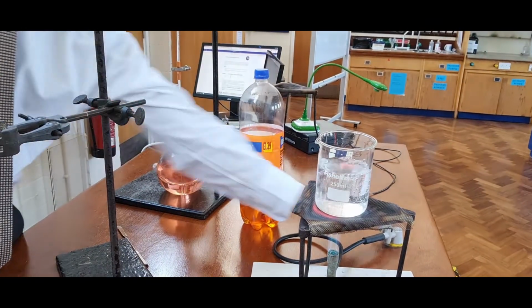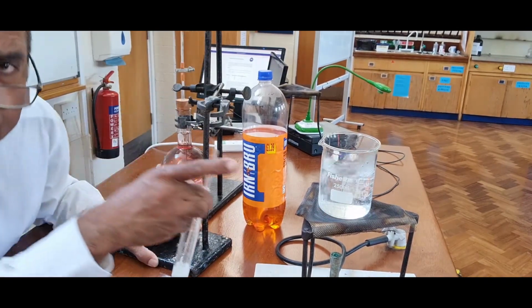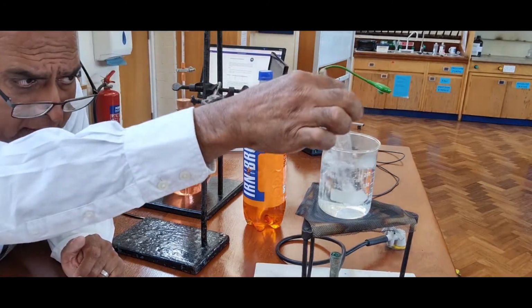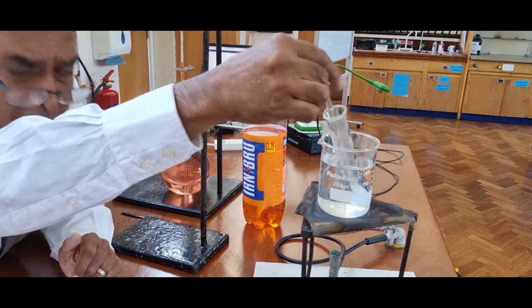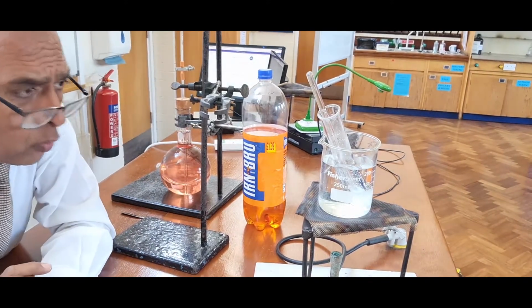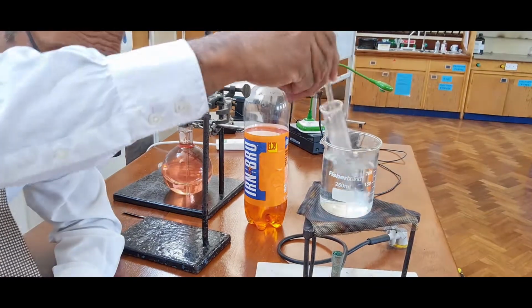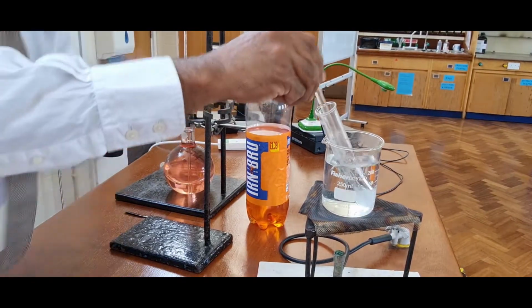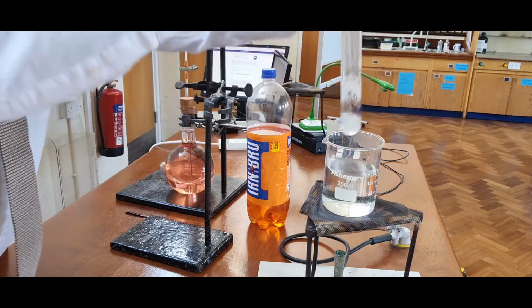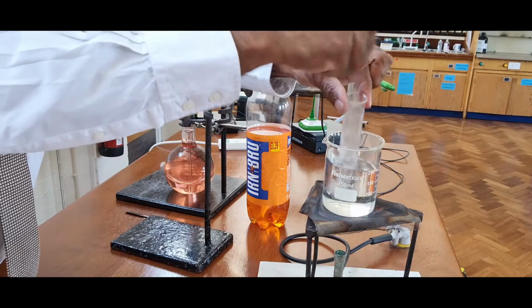Well, that's what that's about. That water's boiling, so I'm going to turn that off. With that water boiling, put this in there. The boiling water will warm up my test tube, and I'm hoping that the ammonium chloride will all dissolve.